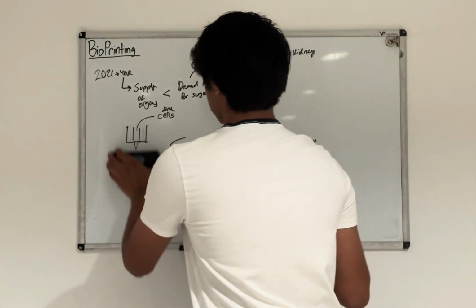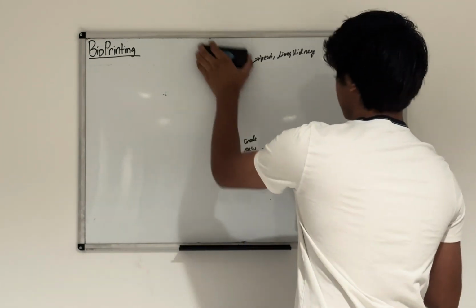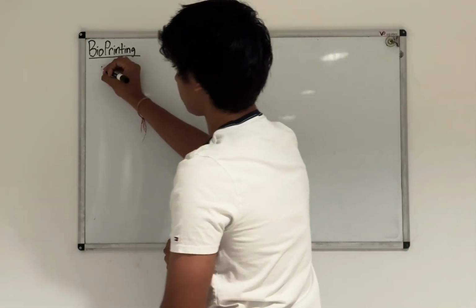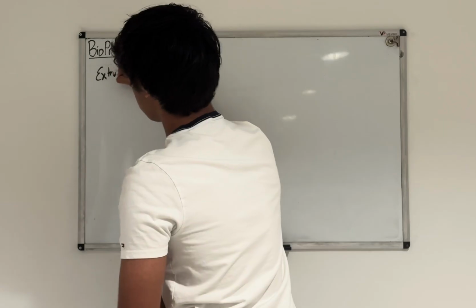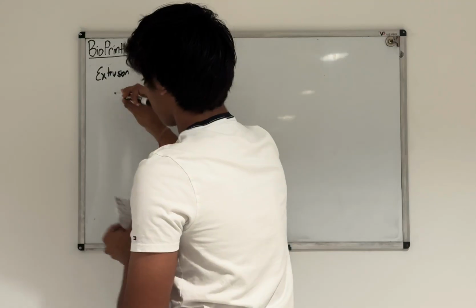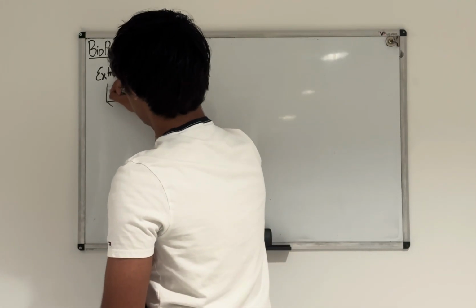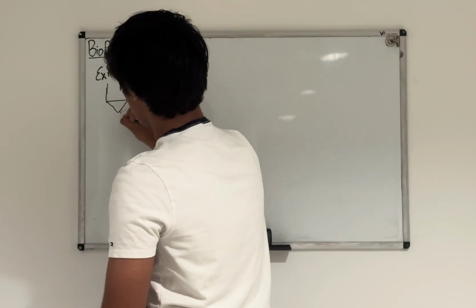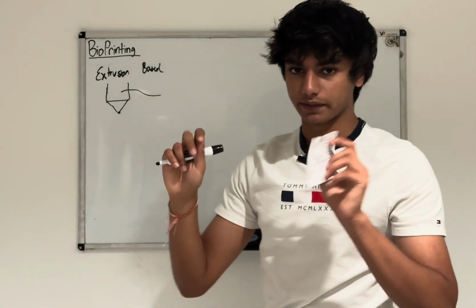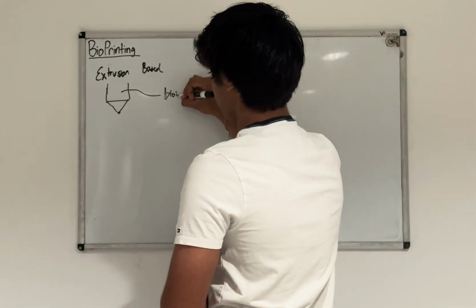The idea with bioprinting today, there are many types of bioprinting, but the main type is extrusion-based bioprinting. Extrusion-based bioprinting is very similar to how a 3D printer works. What you do is you have this ink cell, and you have an extrusion here. This ink cell is filled with something called bioink, a material that we can use to create cells.